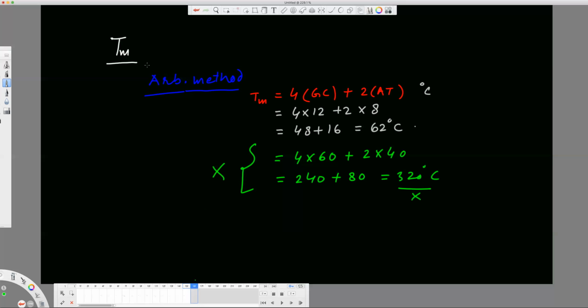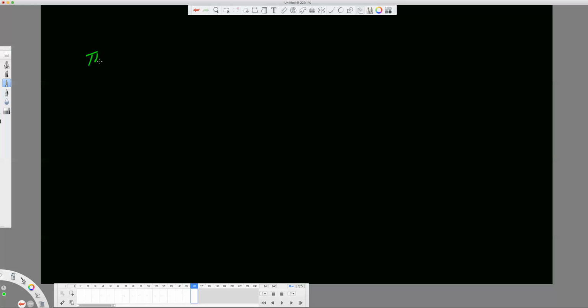So there is another method which is the thermodynamic one, and many of you might be aware of that. I think this is given by Breslauer, roughly the spelling. Breslauer et al., the authors.